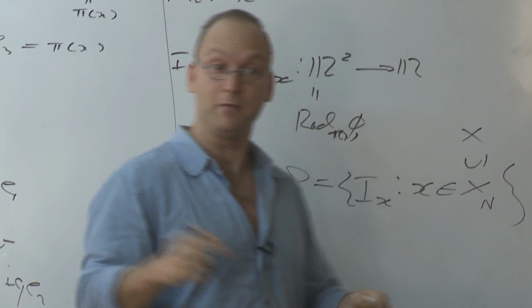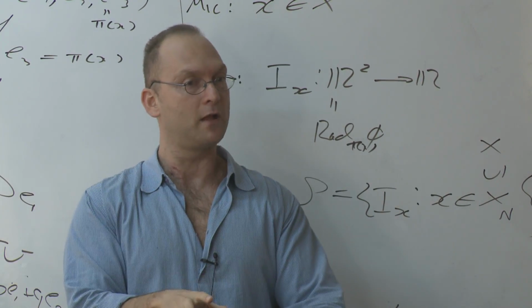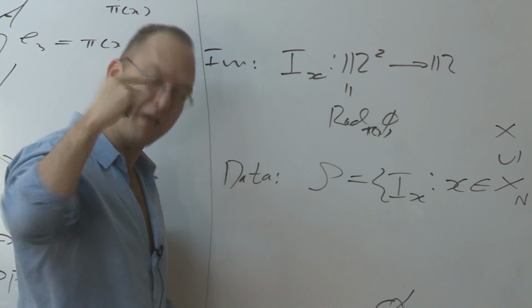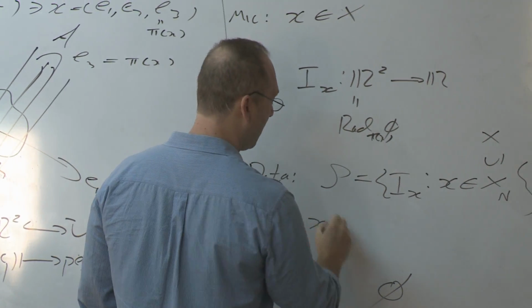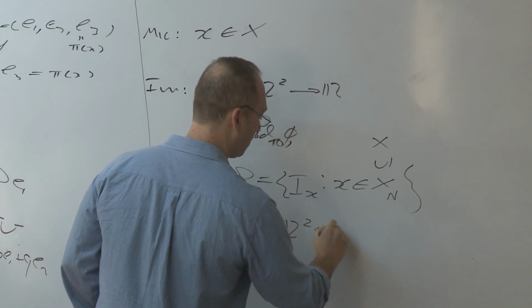If we knew the frame, then we could place every image in its appropriate place in the three-dimensional space and reconstruct the potential by applying the inverse Radon transform. So in this regard, this is only a suggestive notation. It's a label for us. But remember, it represents a frame. And in this regard, the main computational problem is to compute for every image its corresponding frame, or more precisely, the orthogonal embedding associated with this frame.